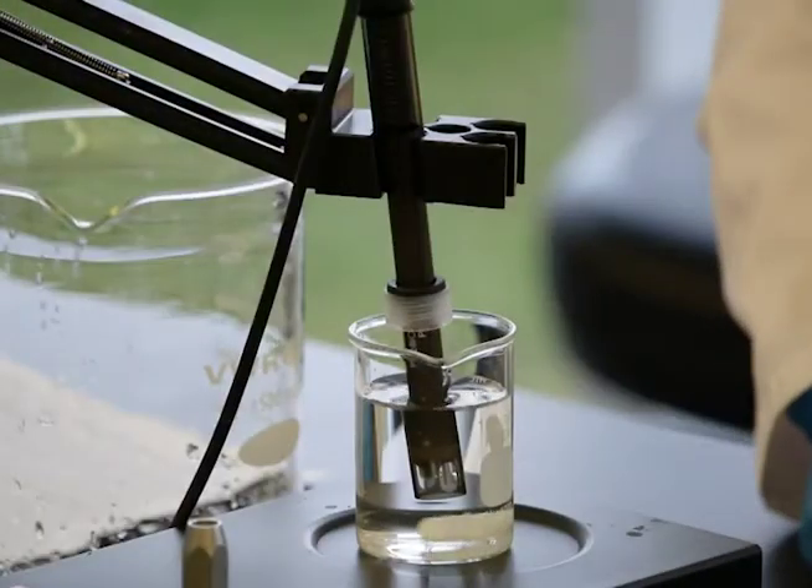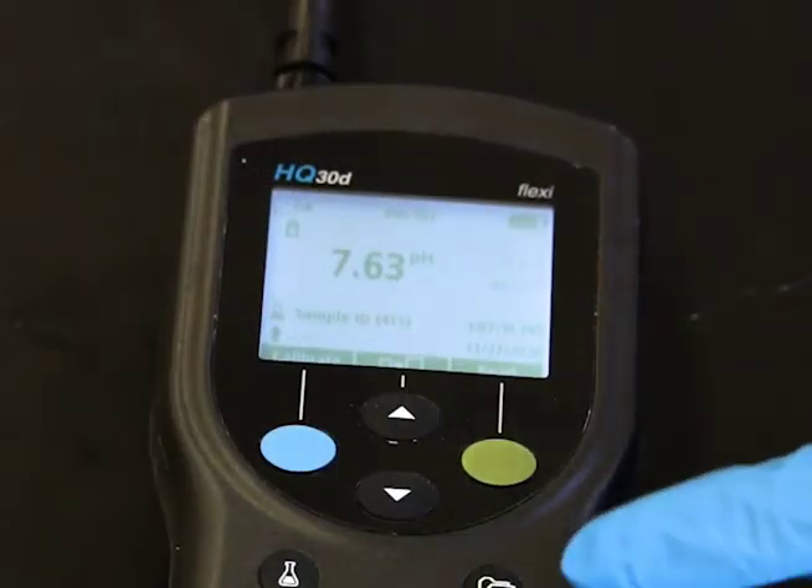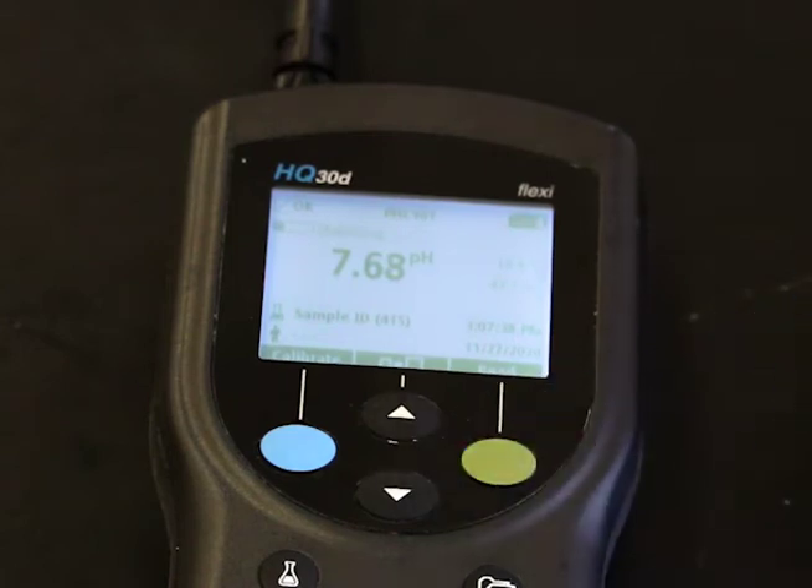Make sure the temperature sensor is fully submerged. Push read. A progress bar will display, and when the measurement is stable, a lock icon will confirm the reading.